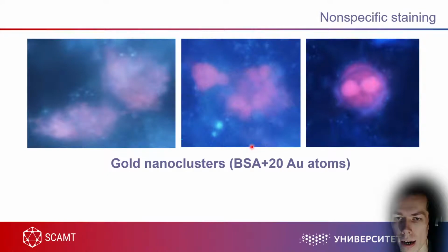In case they enter the cell, they still fluoresce in red, as they should. So red, probably, despite this one, because this was maybe a couple of cells with fluorescence of everything inside the cell, but it's a separate case. In most cases, there were definitely some blue fluorescent organelles and some red fluorescent organelles. The red fluorescent organelles are early endosomes, or just endosomes. So when these clusters penetrate the cell membrane, they retain the ability to fluoresce red.